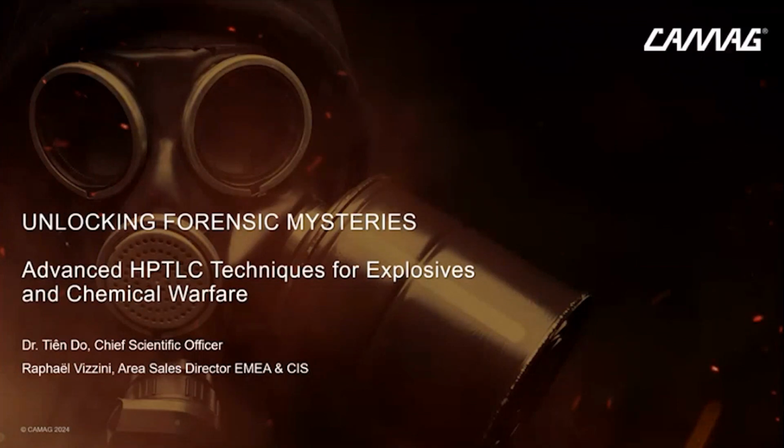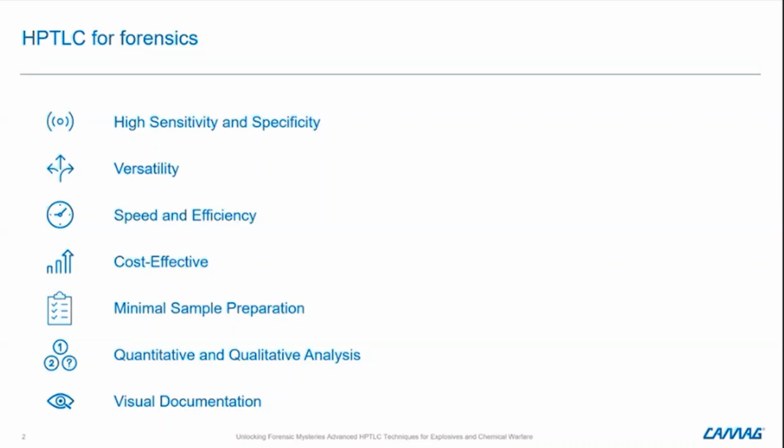Let's dive into the different applications that we want to present you today. We have been having an increased number of people and labs in the forensic asking for HPTLC. This is not because the other methods are not used anymore, but because we have a high number of samples coming to these labs.